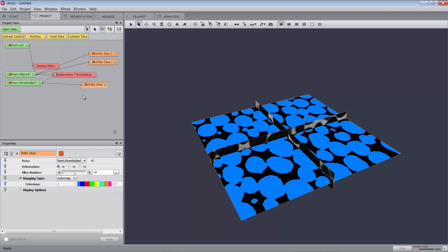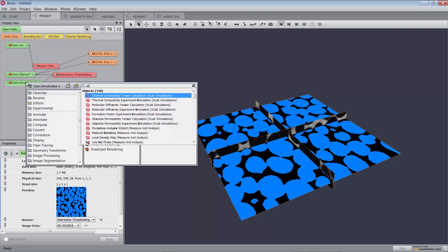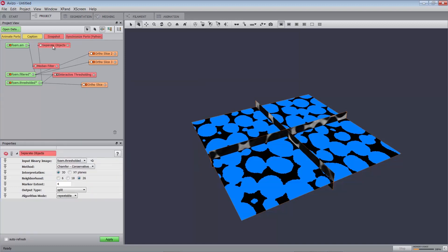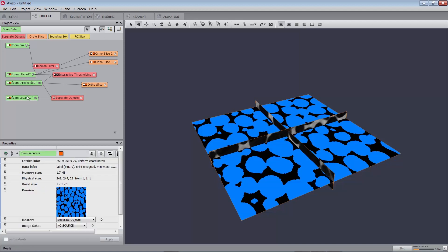You can use the Separate Objects module to separate connected particles. Attach a Separate Objects module to the thresholded data. Set the Marker Extent port to 1 instead of the default value of 4. This is a contrast factor that controls the size of the seeds marking objects to be separated. Increasing this value can merge some markers and therefore decrease the number of separated objects. Then, press the Apply button. A foam.separate data is generated in the project view. Attach the first ortho slice to the new data.